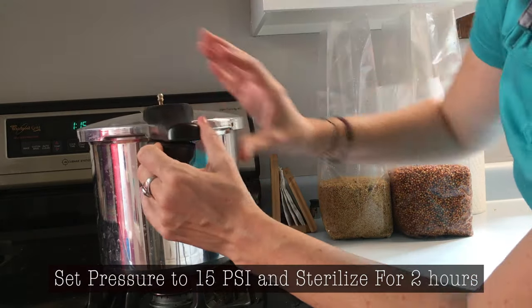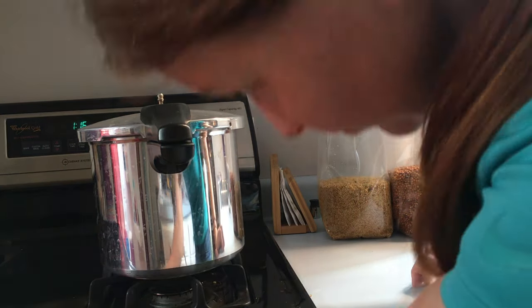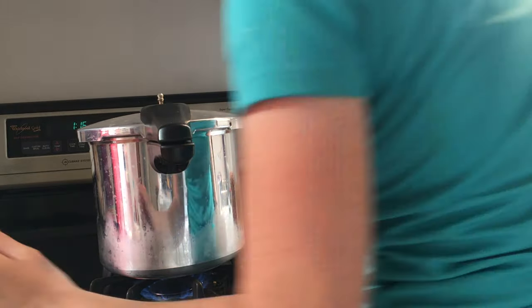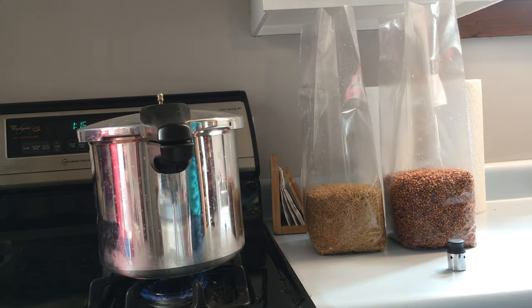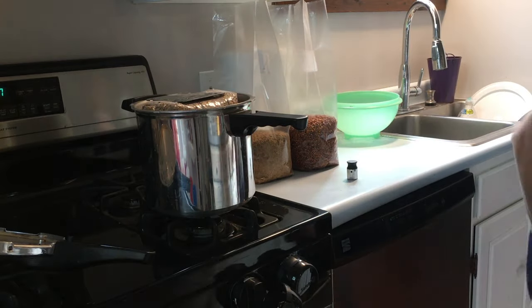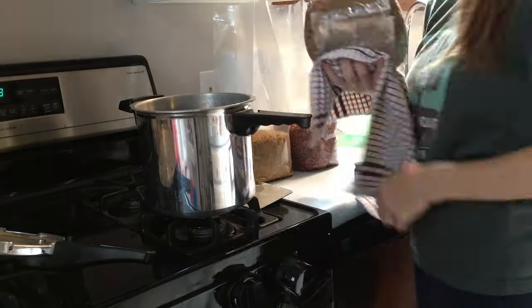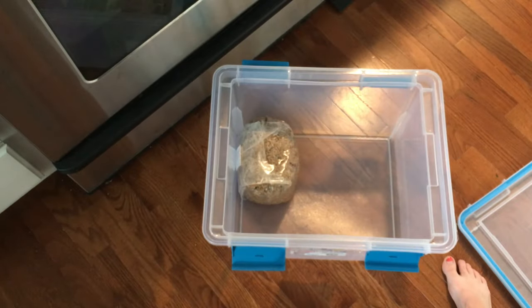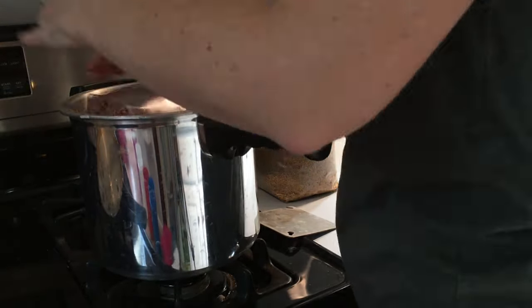Then turn your stove on low heat and sterilize for two hours. These pressure cookers have two main problems: first, I can only sterilize one bag at a time, and second, they heat up extremely fast and don't have a pressure gauge, so it's very easy to overheat and melt the bag. After two hours, turn off the stove and let the pressure cooker cool down. Then remove the spawn bag, place it in a sterile container, and let it cool down for 24 hours. If you inoculate your spawn when they're too hot, it will kill the spores. Now you can start the process over with your remaining bags.